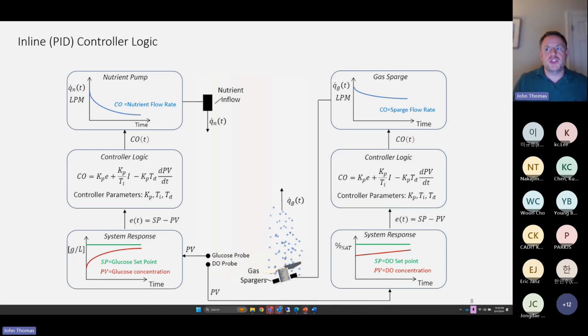In many simulations, maybe we'll look at a glucose blending time, or maybe we'll look at how glucose blending competes with glucose uptake. But we don't typically model how the controller logic informs the addition and evolution of glucose concentration, because the controller logic takes hours to operate, but simulations typically only model, say, tens of seconds or minutes of blend time.